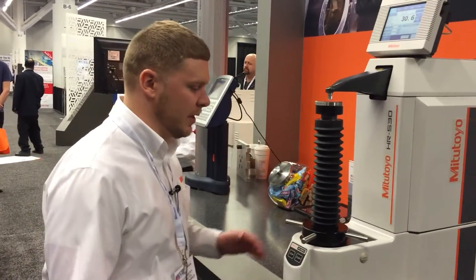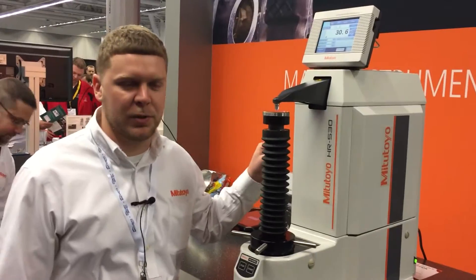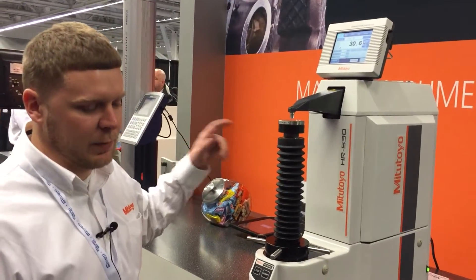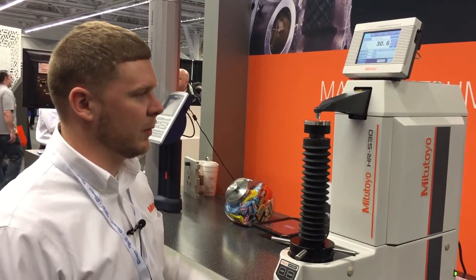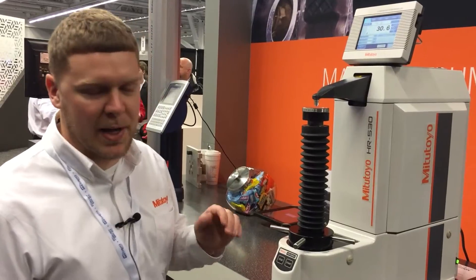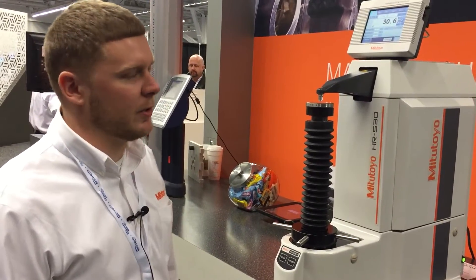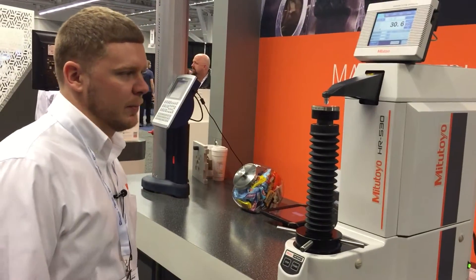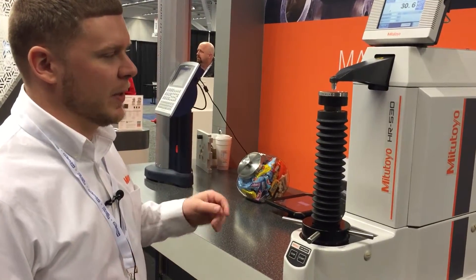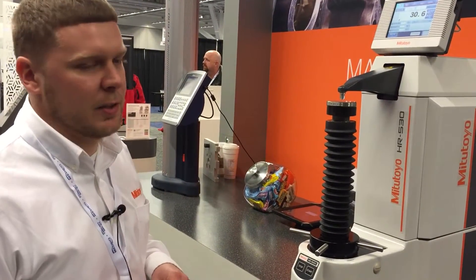The machine right here has a load cell unit, so you don't have to manually change out any weights. You can change between your different tests through the software really easily. It has a manual loading column and an automatic brake, so it's very easy for an operator to use. The machine comes standard with a couple of different indenters, but there are many different indenters you can get depending on the tests you are conducting.